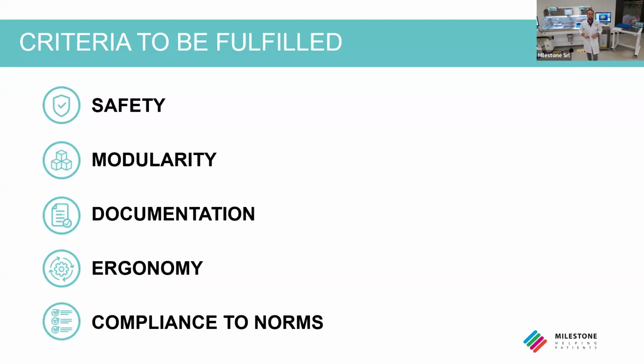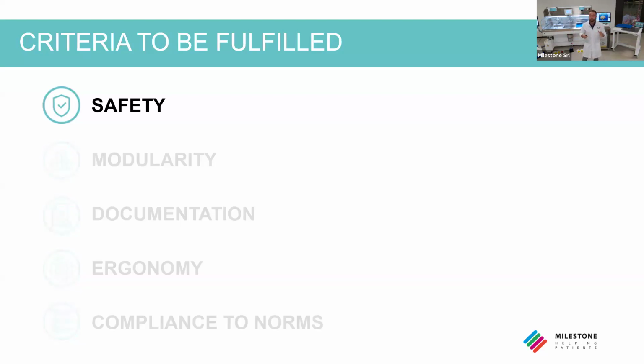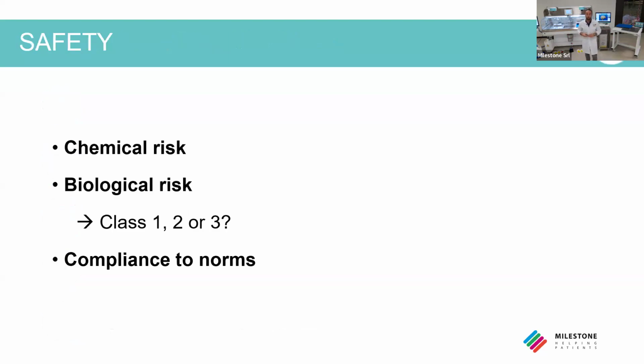So let's start with the first one, safety. Safety, as I told you, is the most important. We must know that we deal with chemical and biological risk.